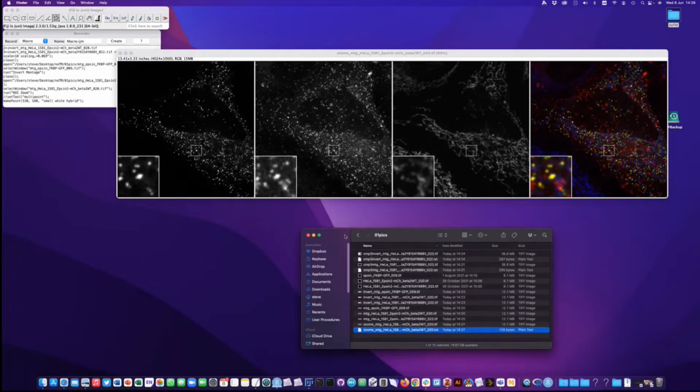Now you can combine those. As long as these montages are the same size, you can compile them into that sort of big panel that I showed you. And you could have zooms on there or not, or you could have them inverted or not. So the idea is you make these sort of rows and then you stick them together with the Montage Compiler. That's the idea.